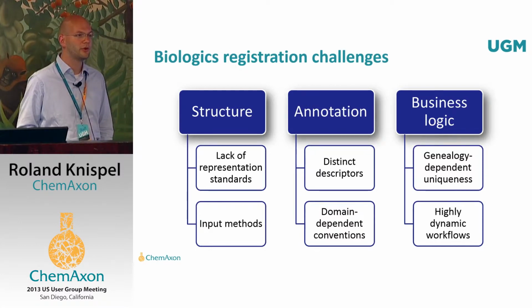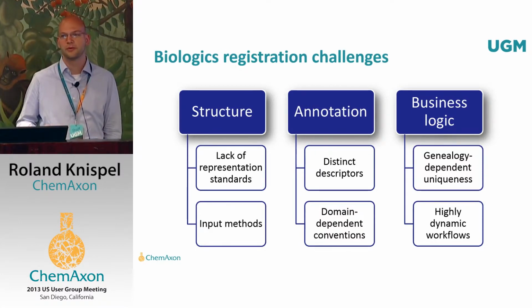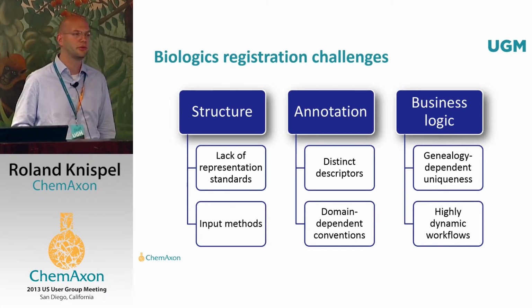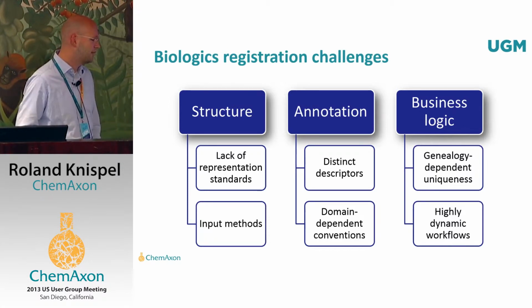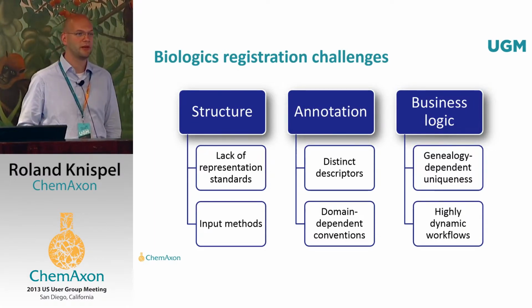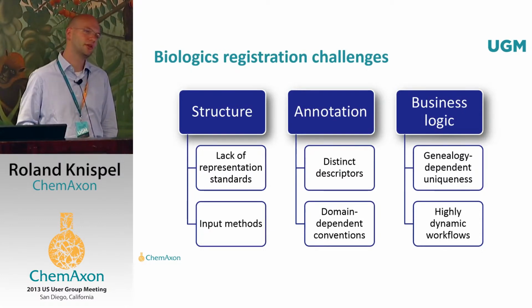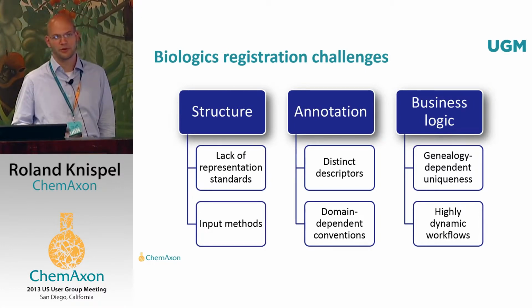The process workflows are often changing with new technology evolving from academic research and basic research. There was a neat example about this. I've been talking to a company about antibody registration. They said they had spec'd out with a consulting company a defined workflow on how to register their antibodies. This process took about 14 months, and then they implemented the system in another 2 months.